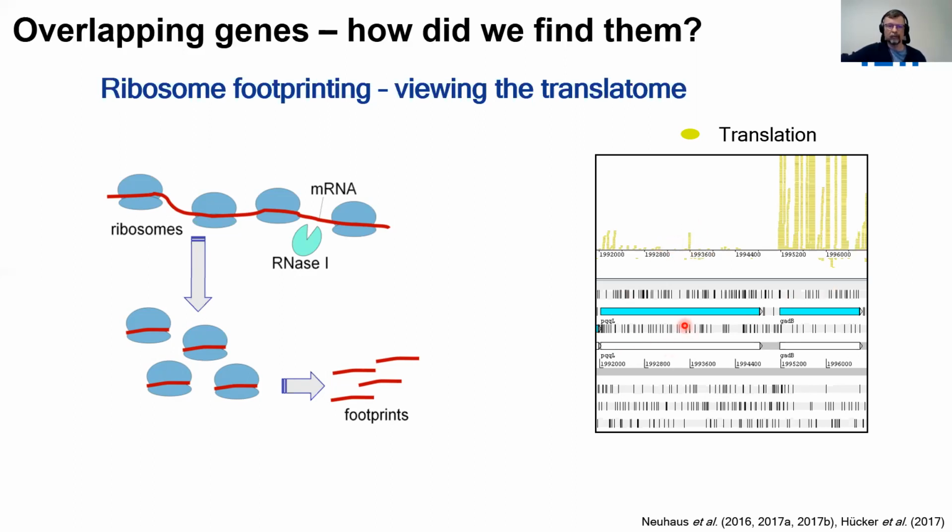It has to do something with the speed of the ribosome running over the mRNA, but there are other effects we don't understand yet. But nevertheless, we see nicely reads on top of this gene. So we can tell this part of the genome has been translated. It was first an mRNA, now stuck in the ribosomes. Very good.